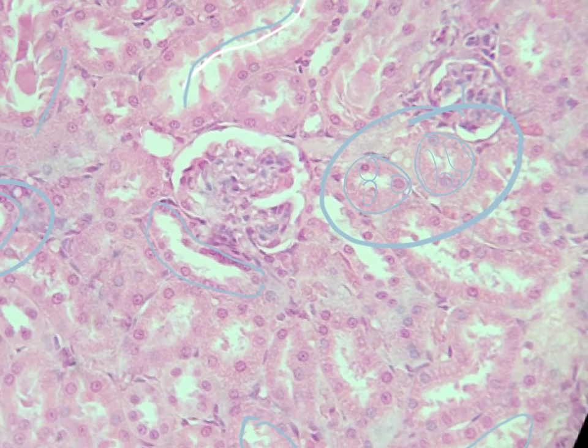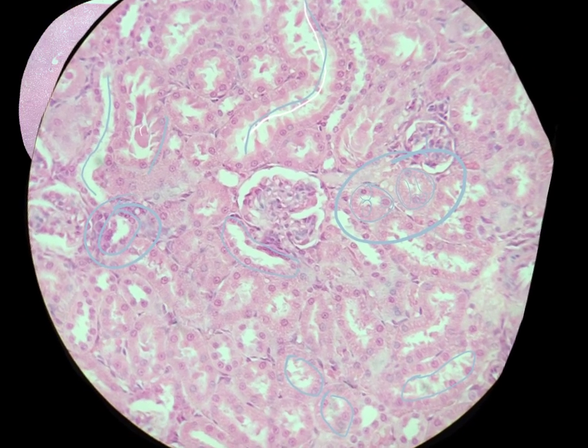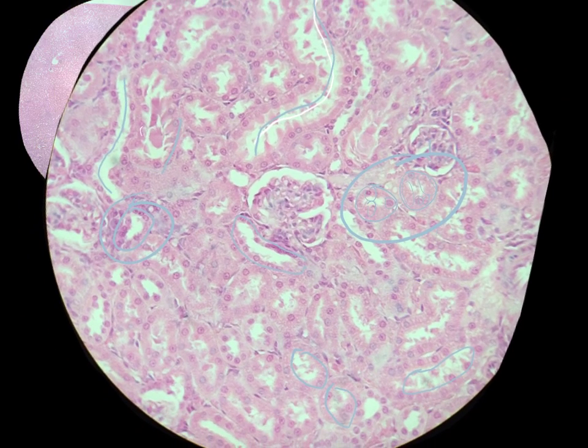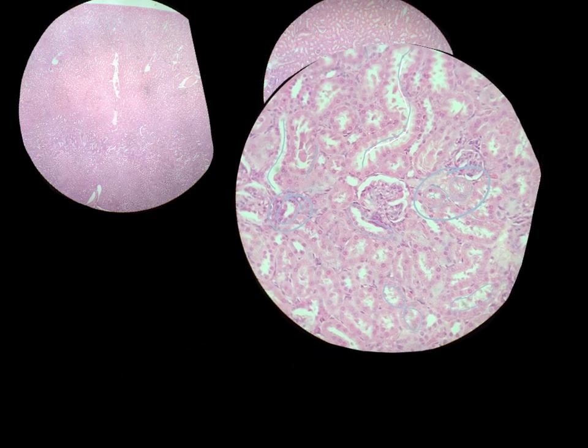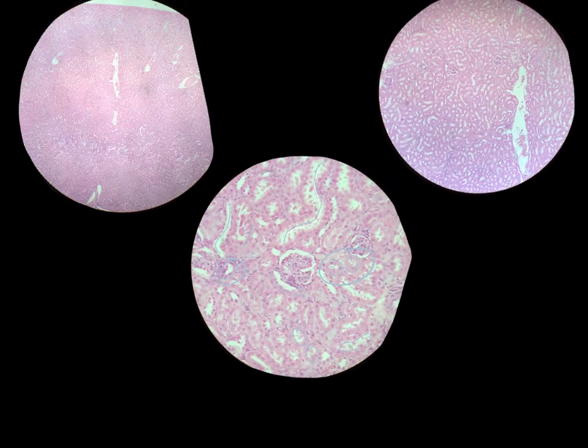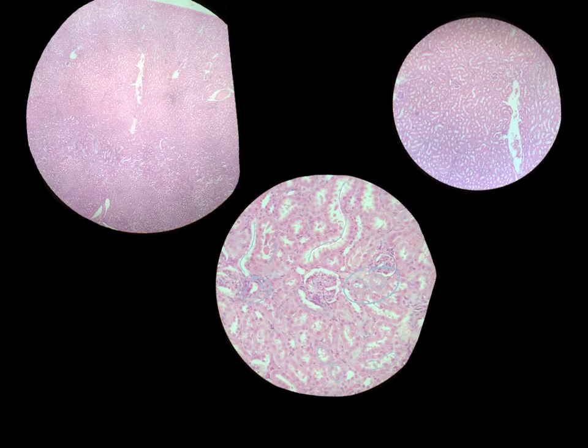And so proximal convoluted cells are much larger. There's a lot more going on in the proximal convoluted tubules, whereas the distal convoluted tubules are simple. They're much smaller tubules, so you're generally going to see all their nuclei in a nice circle. So that's about it for now. The video's long enough. We'll do another one specifically looking at the macula densa, the renal corpuscle, and all those individual components. I'll talk to you later.